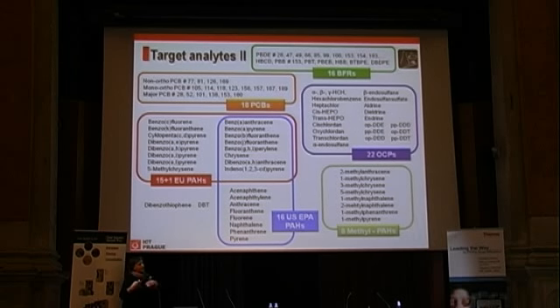Our task was to see what the performance is when using this new sample prep for those compounds. That was the task. At the beginning we had to accept the drawback that using silica we cannot analyze those compounds. That was reality, but when you take the huge list of compounds, that was a small compromise we had to admit. And then we made some optimization of the chromatography using this very simple new QuEChERS-like sample prep.